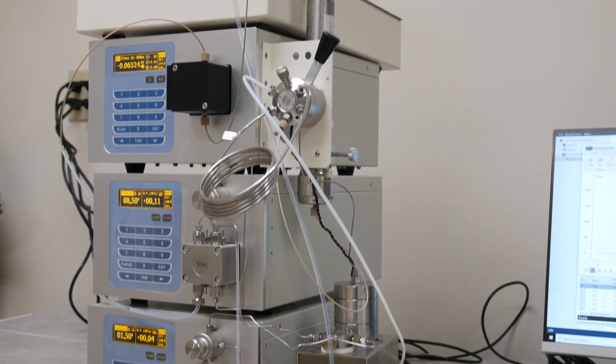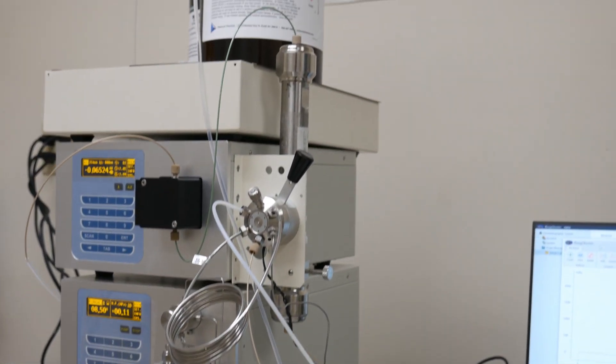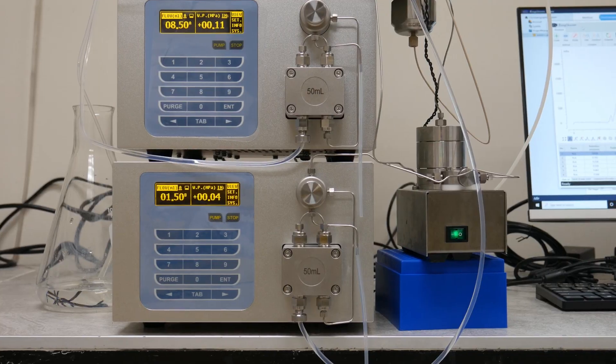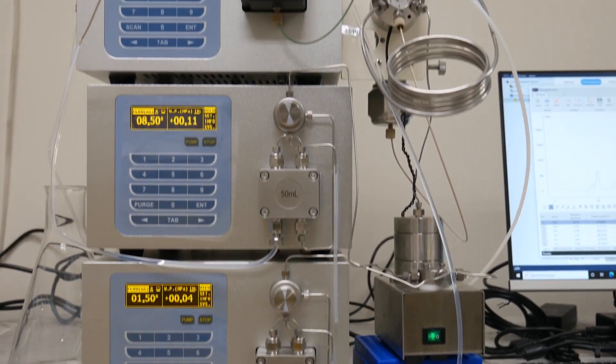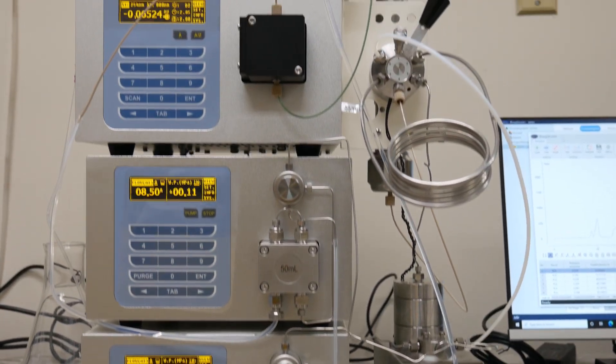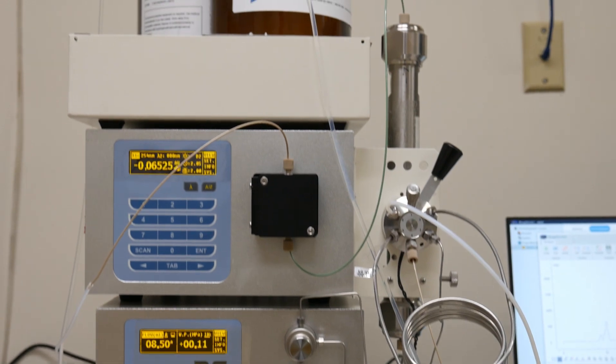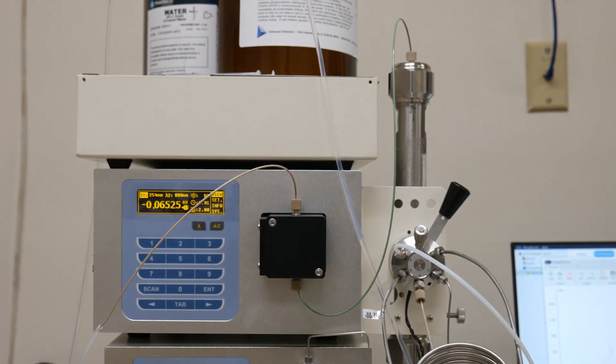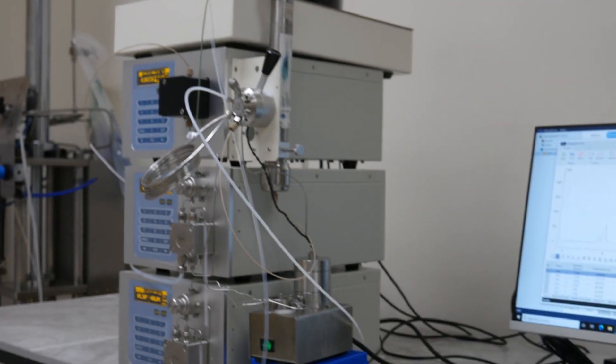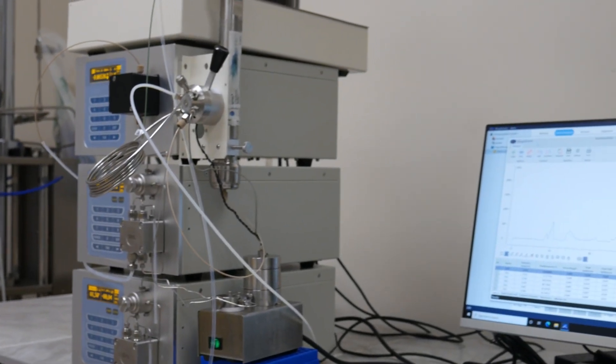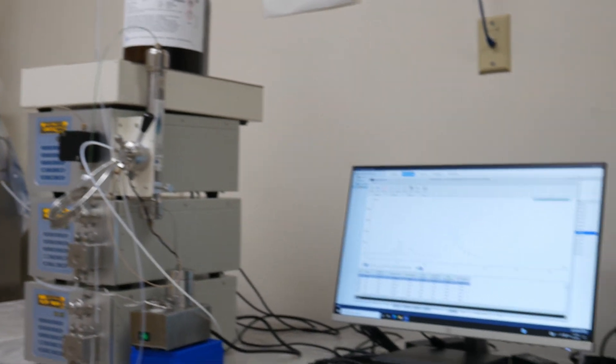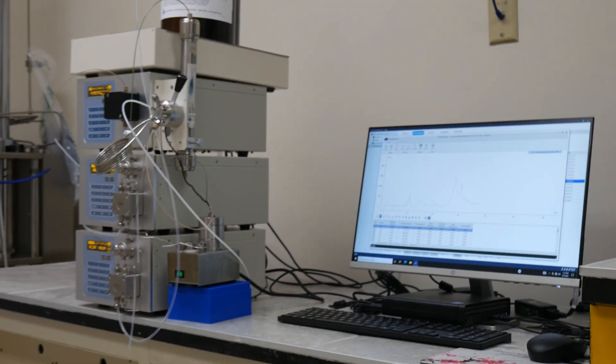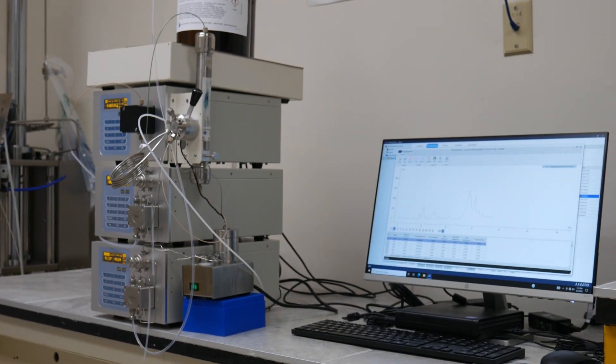This is the Aptek 3300 Semi-Prep HPLC system, which allows up to 50 milliliter flow rate per minute and has a dual channel detector. Operating this system is very similar to operating the Aptek 3300 analytical HPLC system.